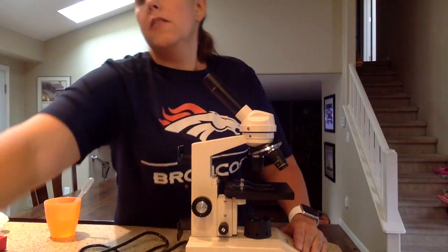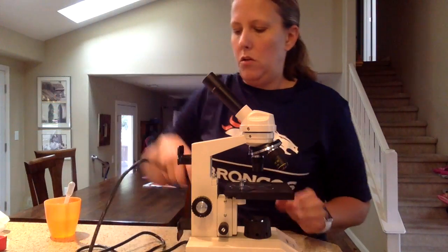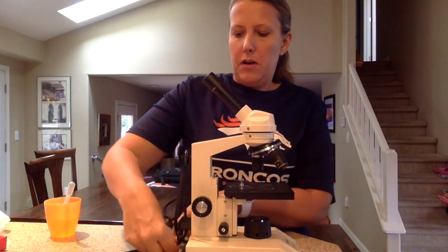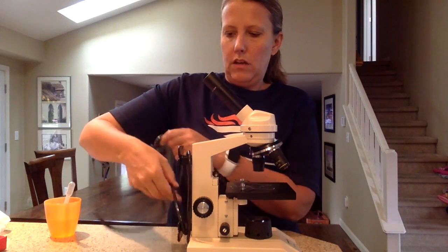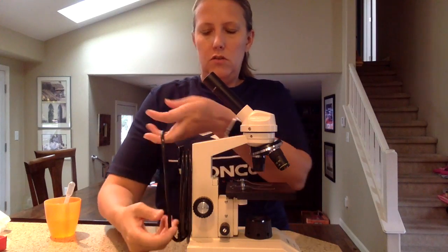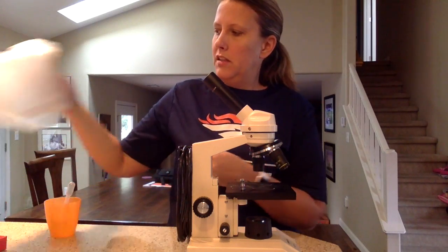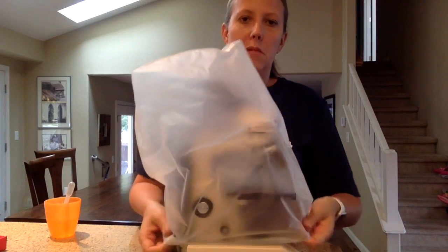If another class is not coming in right after you and you are the last one to use the microscope, you need to clean it up by wrapping the cord. If there's a holder, you're going to use the cord holder; if not, you're going to loosely wrap it around the base. Then put the dust cover on and put it back in the microscope cupboard.